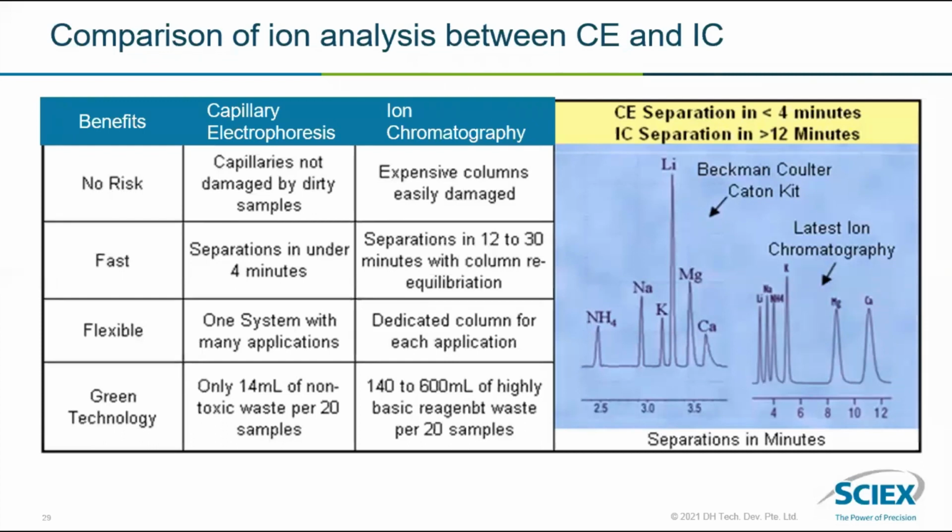and then you can start the analysis. When we talk about flexibility, capillary electrophoresis is one instrument, but it can be used for different applications, like what we discussed. You can use it for chiral analysis, purity analysis, charge variant analysis, and of course for anion and cation analysis.